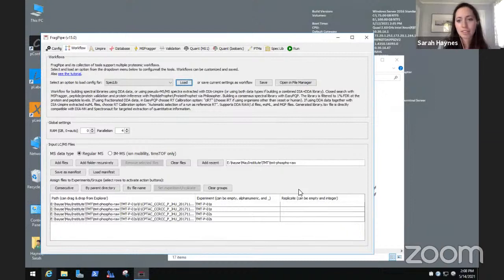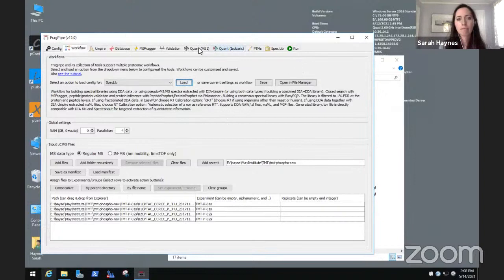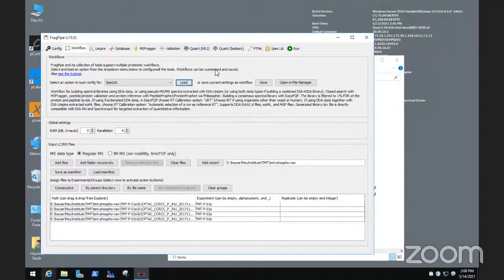So we have another great question in the chat, which is, if I want to analyze the IDs from FragPipe with Skyline later, how do you suggest the use of a spectral library generated from the interact pepXML outputs, or can FragPipe generate a compatible library output? Yeah, that's a great question. What I've done so far is loading interact files, without going all the way through building the spectral library, just taking the PeptideProphet output files and loading the interact pepXML files into Skyline, and it will find the mzML files and will build a library in Skyline.